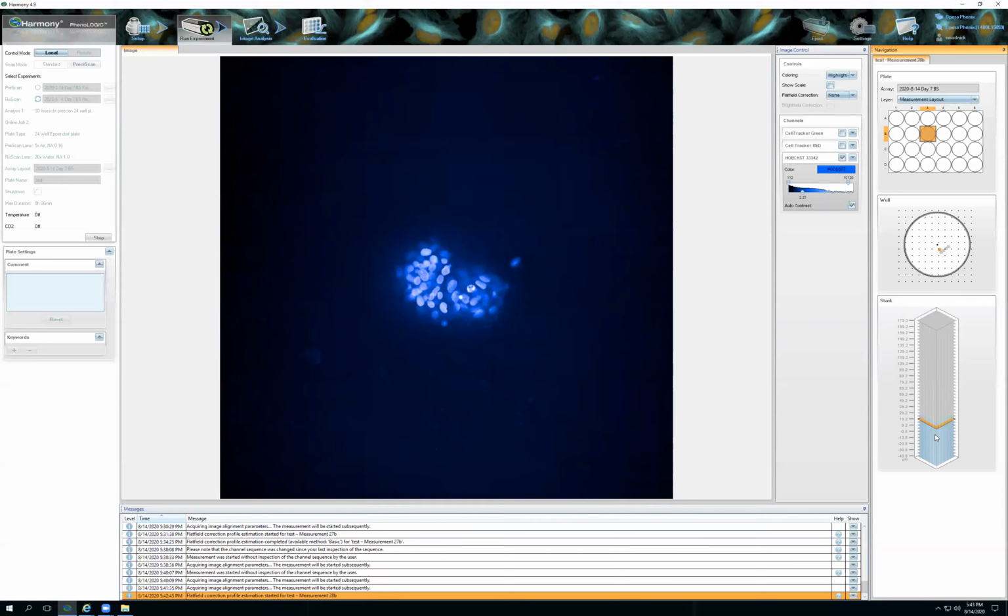So once I click on this, this is moving because I'm hitting the up and down buttons on the keyboard, just so you know, since you can't see that. So again, I can see that my background's pretty low. Even these numbers that aren't nuclei are significantly different than where my nuclei are. If I go up towards the top, I can see that the nuclei intensity still looks good.